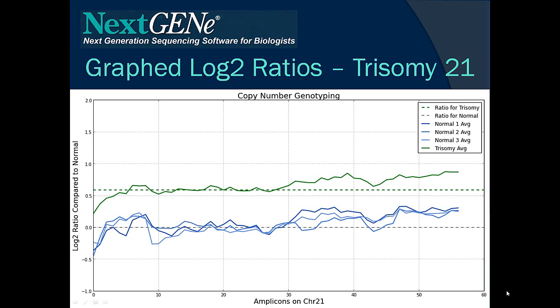And so what we get is this nice, clear result. I also smoothed out the data using a rolling average of 10 amplicons. This is chromosome 21 amplicons — there are about 55 amplicons left after all that processing. The average of the trisomy replicates was around the expected ratio of about 0.6, indicating a 50% increase in coverage on a log2 scale, whereas the non-trisomy samples were all pretty much close to a ratio of 0, indicating the same level of coverage as the control sample.